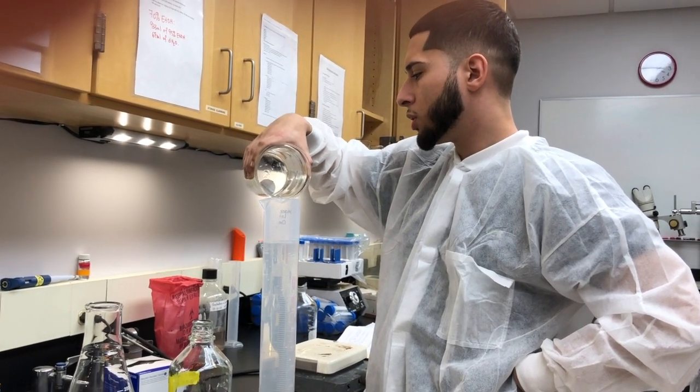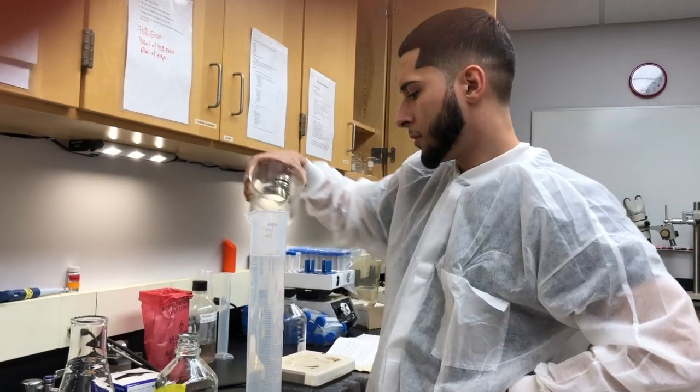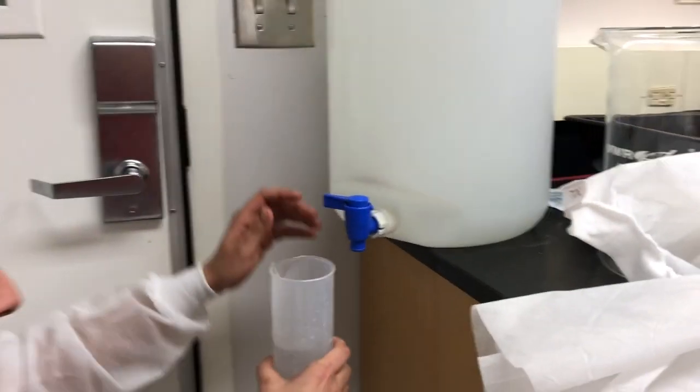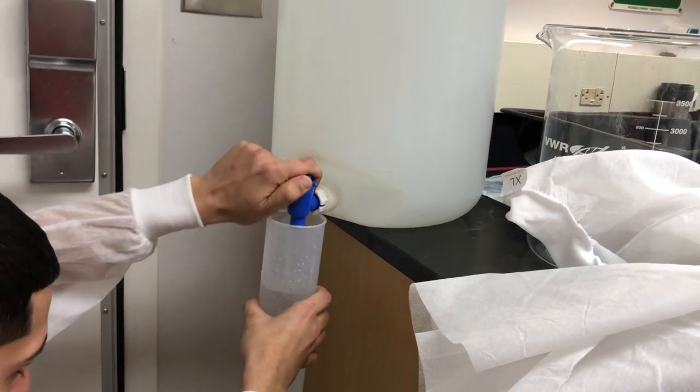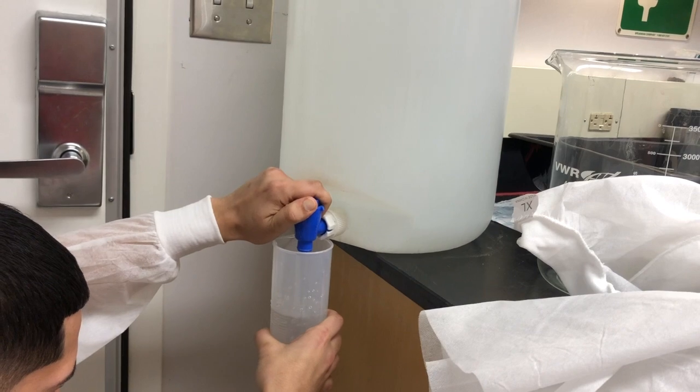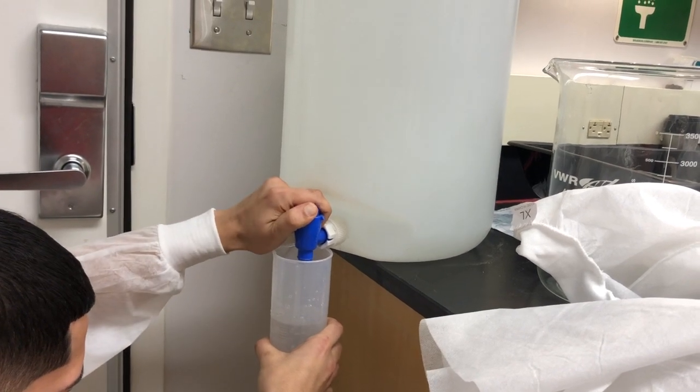You just want to make sure you don't drop your stir bar in here. Now we're going to go back to the DI water and QS it to one liter. There you go — now we have exactly one liter.